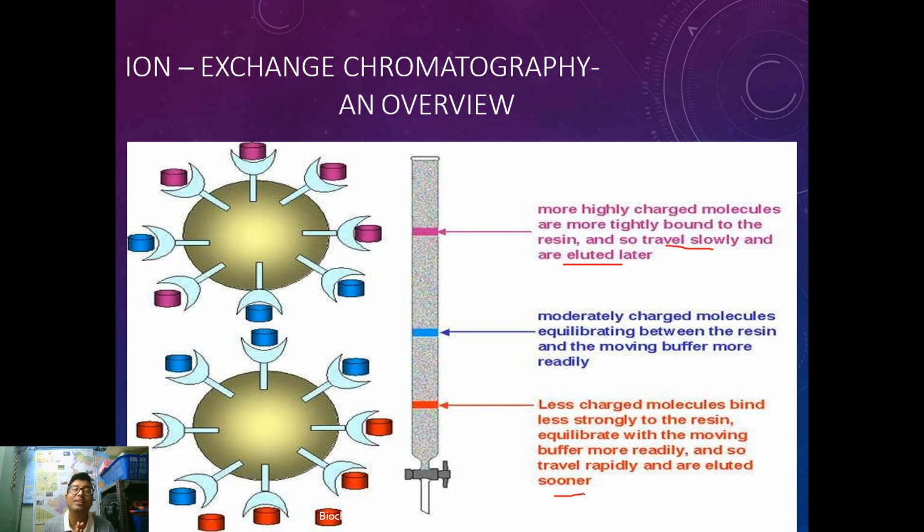So that's it guys, this is in short about ion exchange chromatography. It's very easy to understand if you have the basic concept of ionic interaction, cations, anions, which one will be adhered first, which one will be adhered later. Again, an example is a complex mixture and analytes of proteins and amino acids. And then what will be the final diagnostic test? The diagnostic test will be a color reaction of protein, that is the ninhydrin reaction. So pause this video, go back, recap, and then we'll move on to the next part of the video, which is gel filtration chromatography.